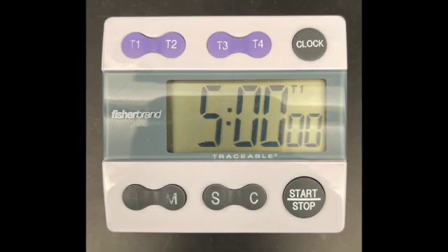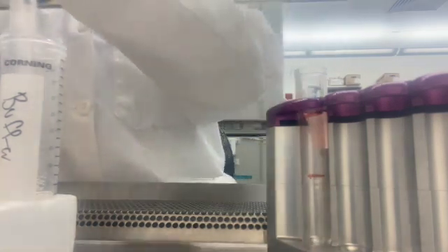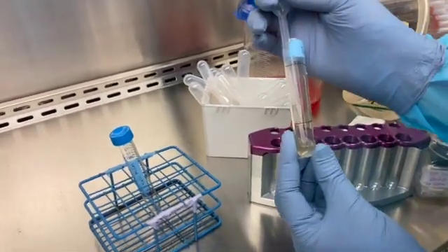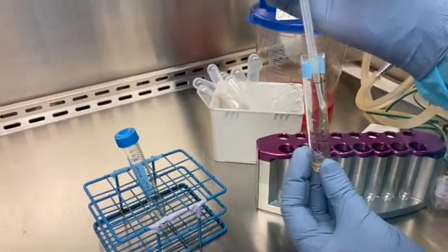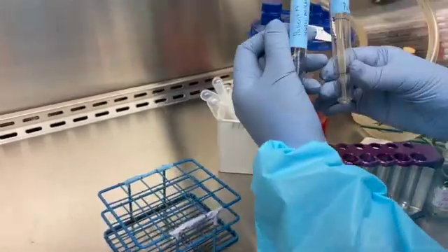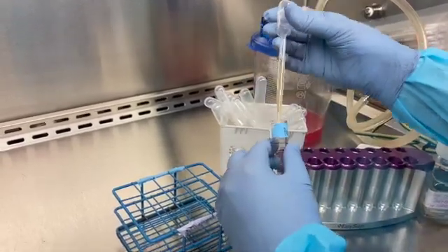Set your timer for your final 5-minute incubation. After 5 minutes, take off the supernatant going all the way to the bottom of the tube. Take the tube out of the magnet and add roughly 2 milliliters of buffer, rinsing the cells off the side of the tube. Transfer your sample from the 14 ml tube to a regular 15 ml tube with the patient label.